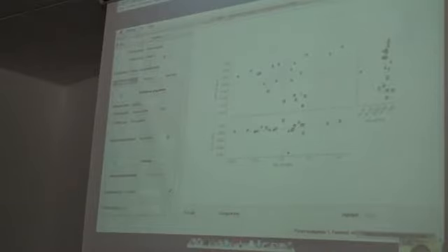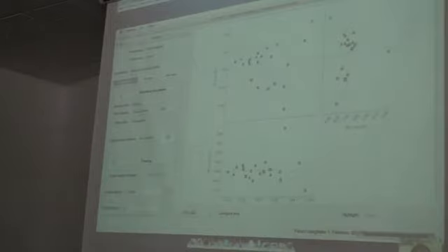But if you want to see what this PCA plot looks like at different levels, it's really easy to change. So this is at the family level. If we go with more detailed information, at level 7, it's going to update and now change and show you this. And it colors the points by the grouping, and you can also interact with this, so you can click on different samples to see what these represent. So it tells you the group that it's in and also the sample ID. Okay, so we'll stick with level 5.